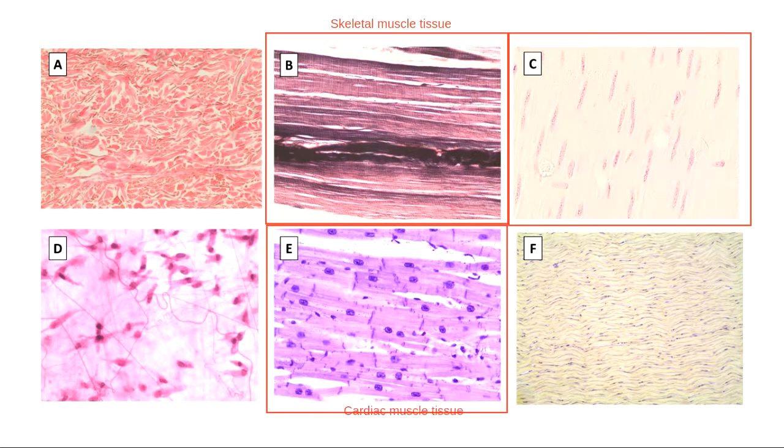Oh, that was terrible. Move it down. Okay. Cardiac muscle tissue down below. This is cardiac, a striated type of muscle tissue, like skeletal muscle tissue I see up here. When I look at skeletal muscle tissue, you can see those alternating light and dark lines. But the other thing you see with skeletal muscle tissue is cells that are very long and skinny. Very long and skinny cells.